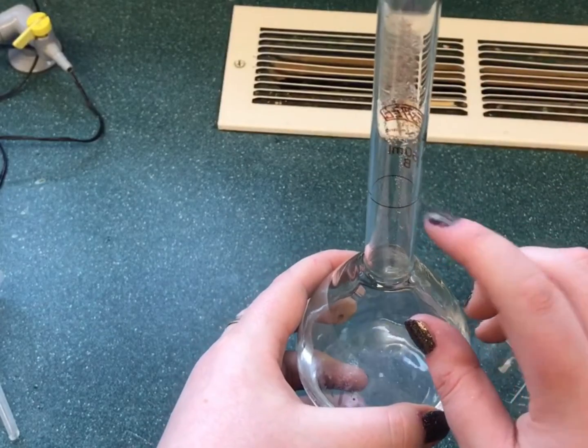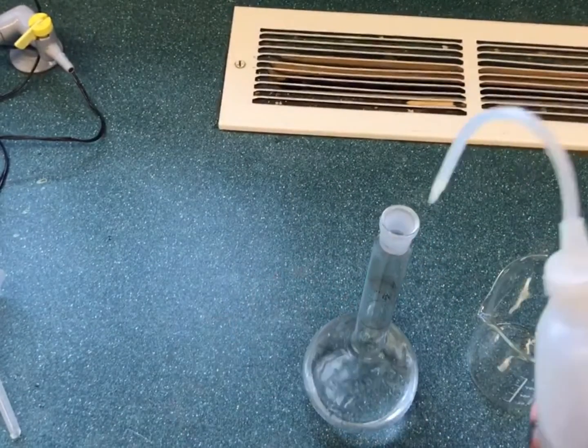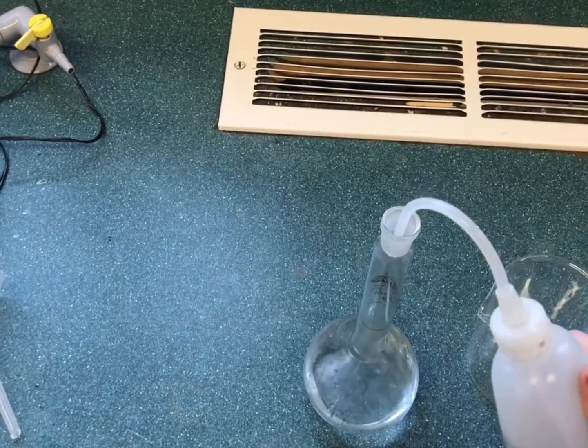The solution is then made up to the graduation mark on the flask using deionised water, until the meniscus sits on the line.